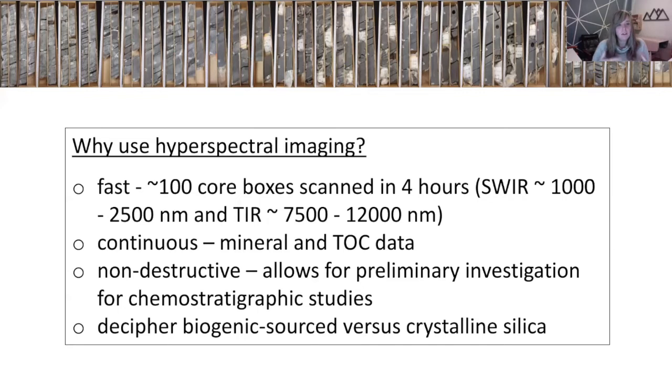In terms of collection of data, though, if you have a limited amount of time with a certain core, it's a great way to get a ton of information out of it very quickly. You can obtain continuous mineral and TOC data. It is non-destructive. A lot of the time in core labs, they will say you can't sample in certain intervals. They want to preserve the core for as long as possible, which is great. So this is a technique that allows you to analyze many, many things without actually taking any samples.